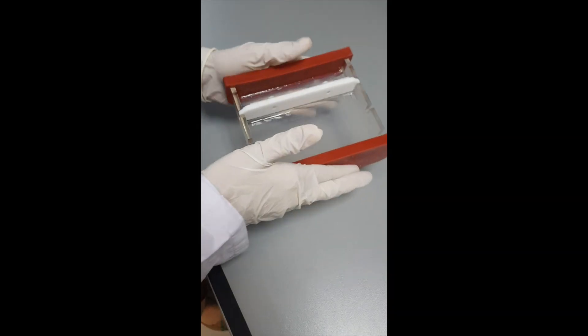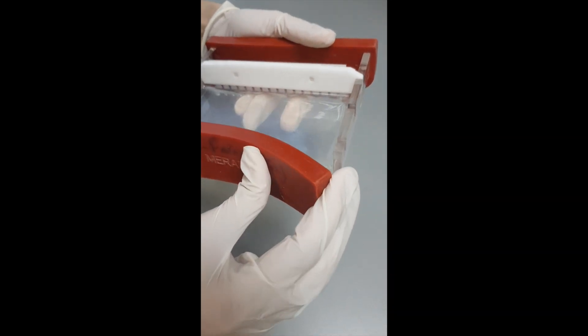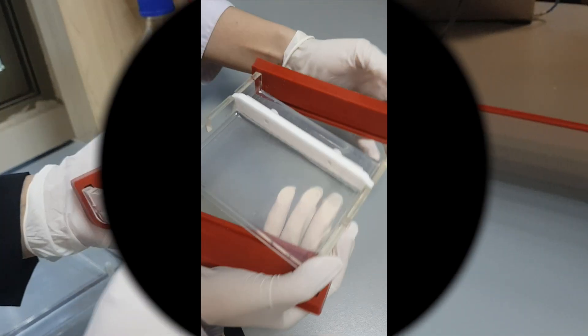Check the gel after 10 to 15 minutes. Remove the rubber pads and you can see that the gel is solidified.